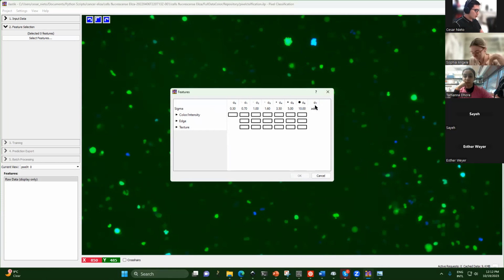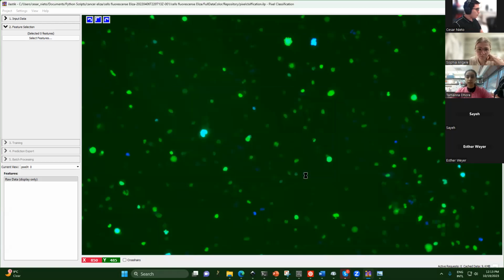It also depends on the speed of your computer and the number of features you're going to use for training the neural network. I'm not very expert on which features are optimal, but the program also helps you get the best features, but that's going to be later.